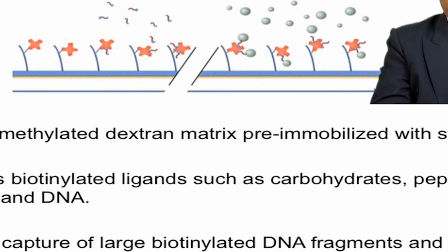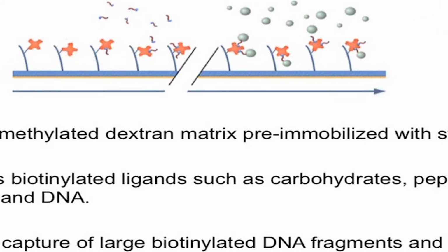They bind to biotinylated proteins, peptides, oligos, DNA, and RNA, and help to immobilize these molecules in any interaction process. Ideally, literature is available for biotinylated DNA fragments, nucleic acid interactions, and peptides that have been immobilized on this surface.